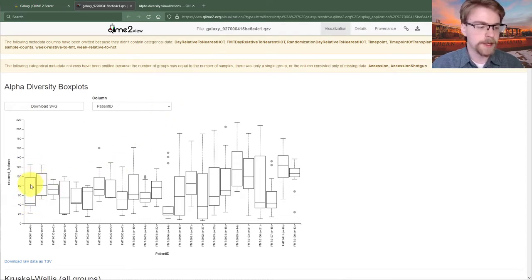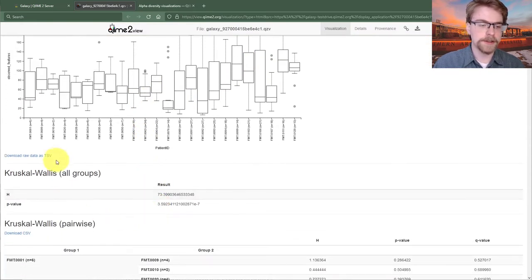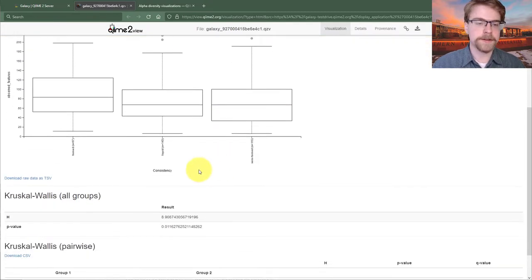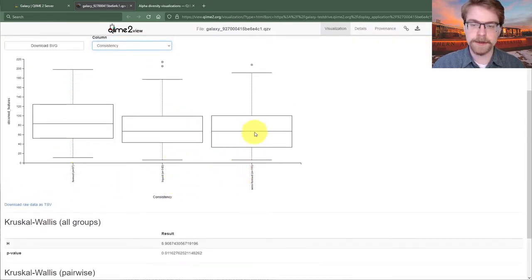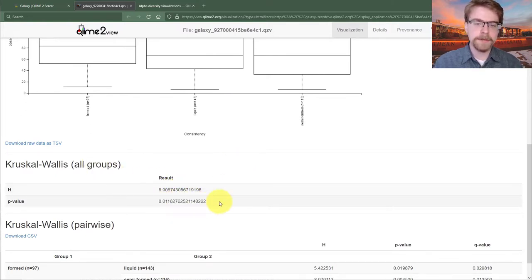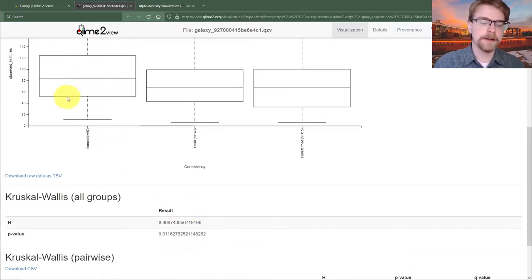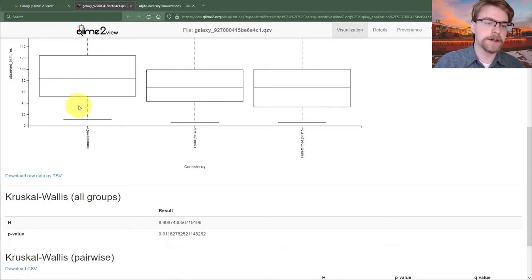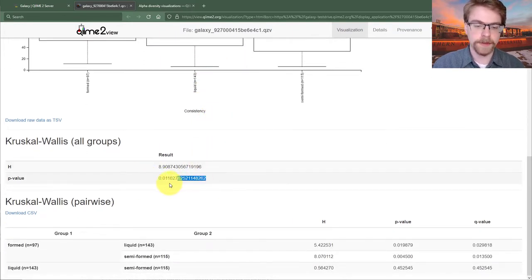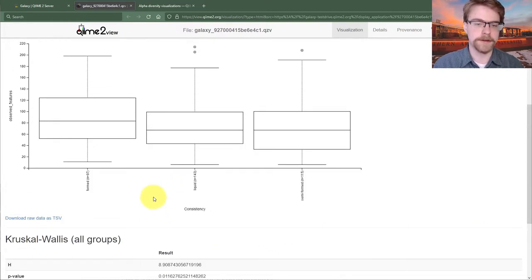Something important: because these are individuals who were sampled repeatedly, we're violating assumptions about independence. The initial Kruskal-Wallis test is valid when comparing different groups, but looking across patient IDs becomes a little more nebulous. Looking at consistency — formed stools, liquid stools, and semi-formed stools — Kruskal-Wallis reports a significant result, but keep in mind we've violated independence because the same patients are correlated with themselves. Nonetheless, we do kind of expect this result.